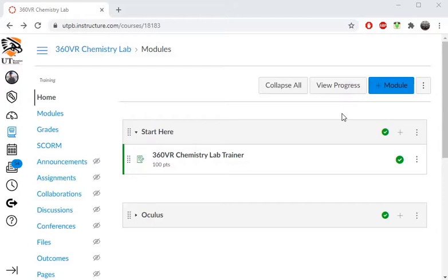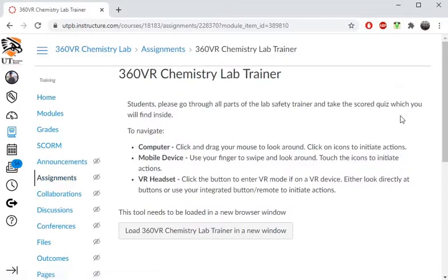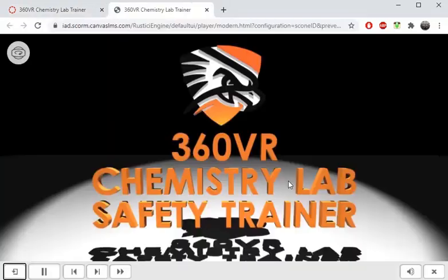This project is SCORM compliant, and I have imported it as a graded assignment. Let's first take a look at the assignment. Obviously, there's a lot more that we could share about this in the instructions, but the main takeaway I wanted to impart was how to navigate this special method of instructional delivery. Here we present students with the option of using their computer, mobile device, or VR headset. There's a wide range of devices students may have, however, this list covers the main types quite well.